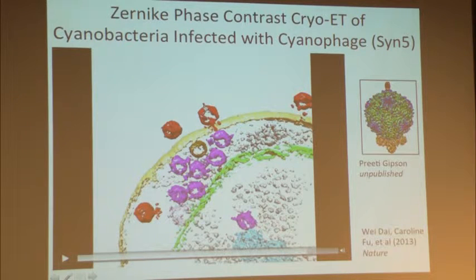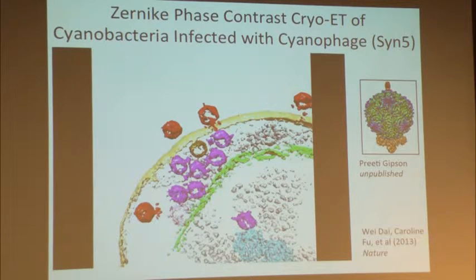Now, the interesting thing is there's additional density sticking out. This virus is very unusual. It has an additional, we call it a horn protein protrusion, on the opposite end of the tail, okay? And from this picture, it's quite clear this horn has nothing to do with the binding to the cell surface, the phage tail, as in all the other bacteriophage. So that also answers the question about the biological role of this horn protein sticking out: it's for different reasons, but not to do with the cell attachment.